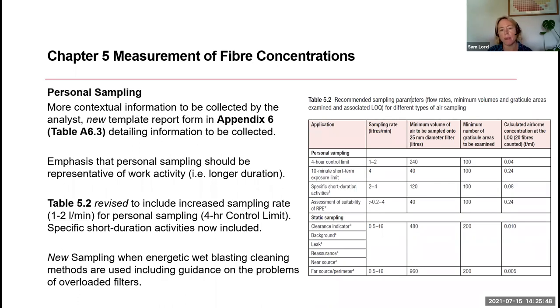Emphasis that personal sampling should be representative of the work activity. Unfortunately, there is this sort of culture, I suppose, or habit, of just doing monitoring for an hour, that equals personal sampling for asbestos. That's not always correct. Certainly it needs to be representative of the whole work activity or the whole work day. But depending on what you want the result to mean, and I'll talk a little bit more about that in a minute. Table 5.2, again, those of you that are involved in sampling, this will be of relevance to you.